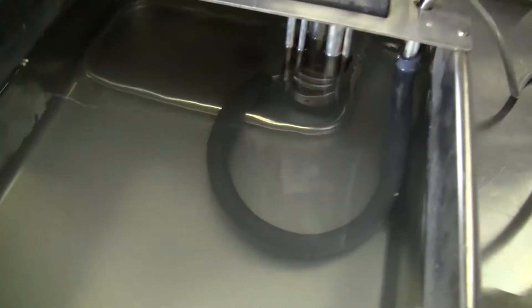Taking a look at the inside of the bath. Your internal recirculation loop heater.